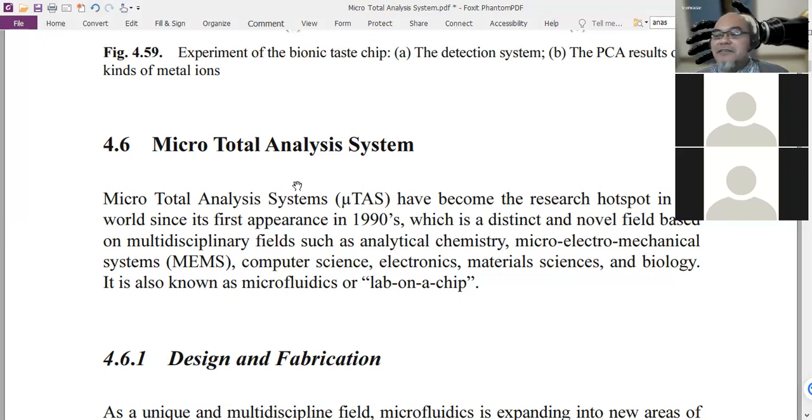The other way is using batik cetak-like technology. For batik cetak, you make the cetakan, the template, using PMMA, or you can use 3D printing, either acrylic or plastic made from a 3D printer. Then you use that to pattern the hydrophobic barrier in the fabrics. It's another way.